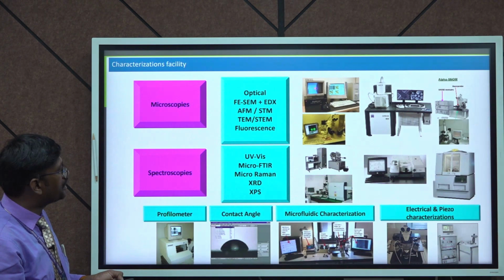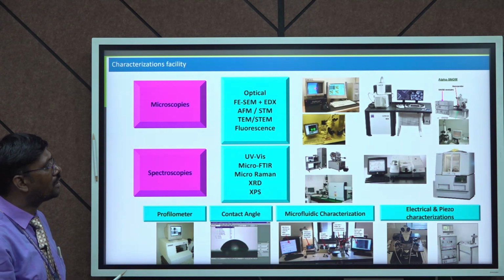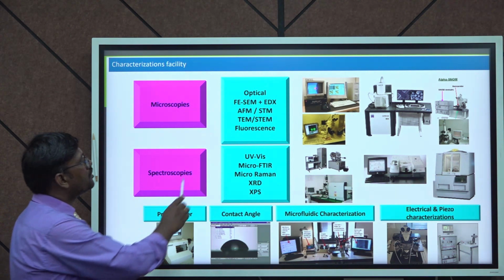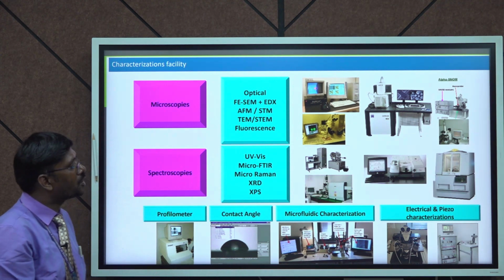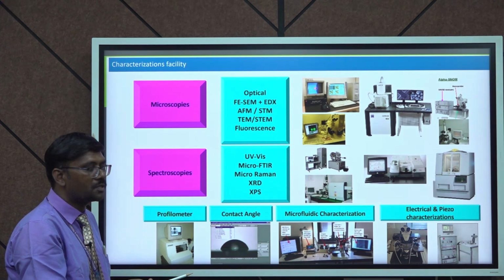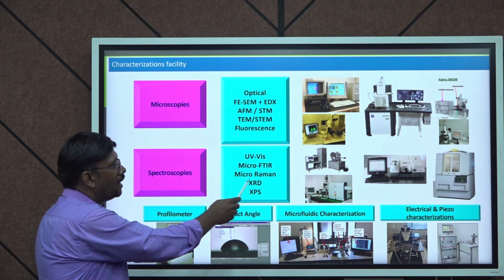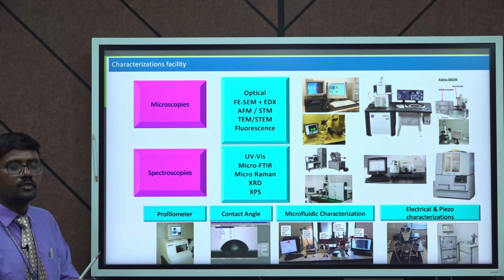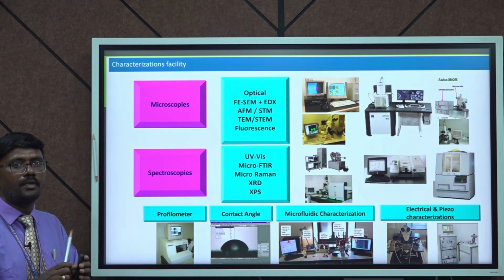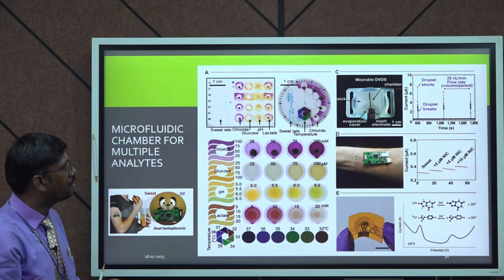And the characterization of the MFD requires multiple tests. You could use FESEM, AFM atomic force microscopy, TEM, fluorescence microscope, UV-vis, XRD, XPS. There are different characterizations you can go through to check whether the MFD has been prepared properly or not.